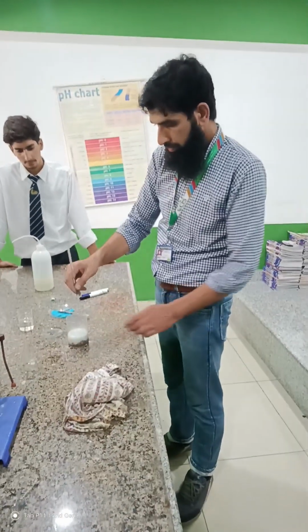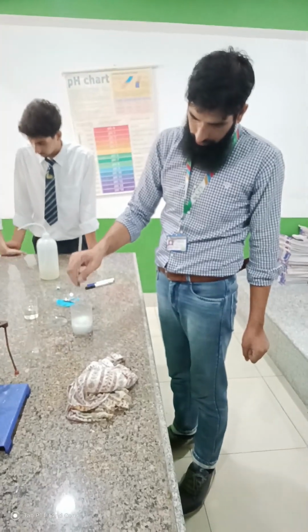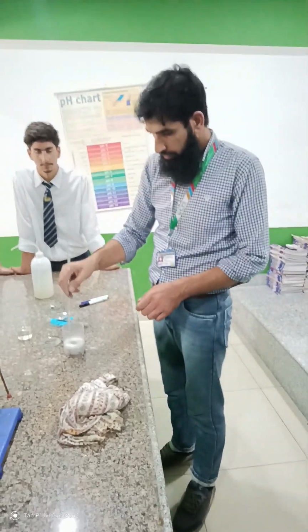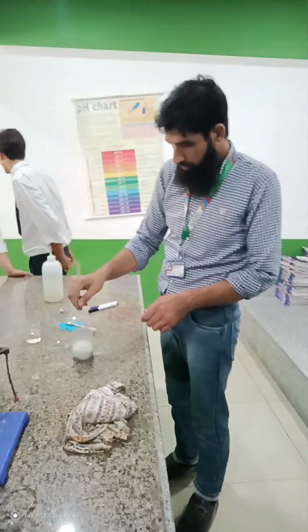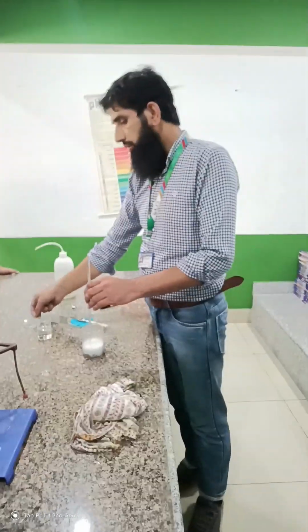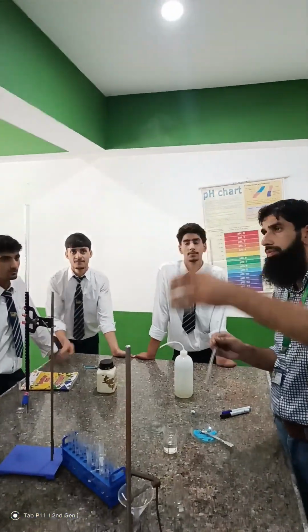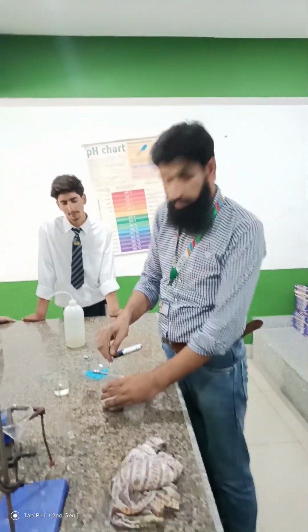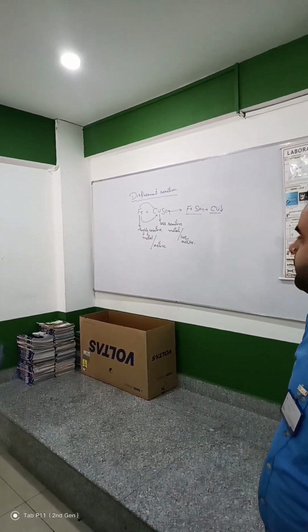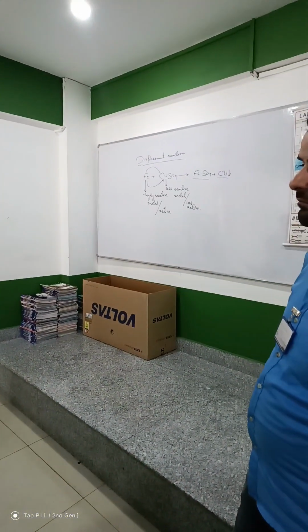You can see how the reaction is taking place. The iron metal that we poured in it was black in color. You can see the precipitate, it is red in color. Then what is this red color precipitate? It is FeSO4 plus... This red color precipitate that settles down is copper. While the iron sulphate will remain dissolved in the solution.